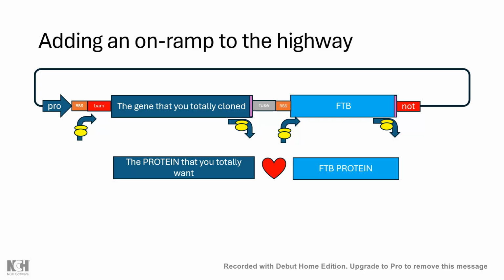And as a side effect, because if these guys are, like I said, like Torval and Dean, who, okay, you'll have to Google that one. Morecambe and Wise, also Google. Laurel and Hardy, whatever. Point is that using BamHI and NotI, you can take this union to another E. coli vector, and it'll have its own ribosome binding site still sitting in the middle there, so they will still function as a unit, because you chose where you fuse and where you clone.